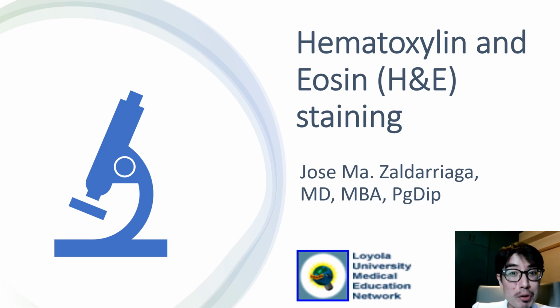Hello and welcome everyone. This is a quick review on histology, particularly on hematoxylin and eosin staining or H&E stain. We are indebted to the Loyola University Medical Educational Network or Lumen for the excellent histologic slides which we will see shortly.